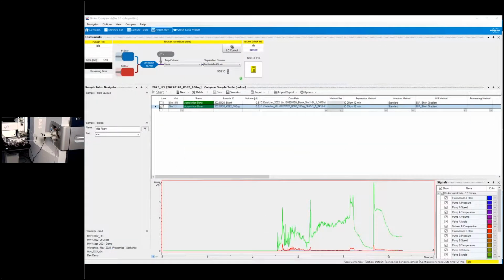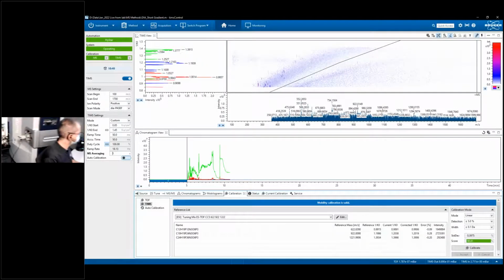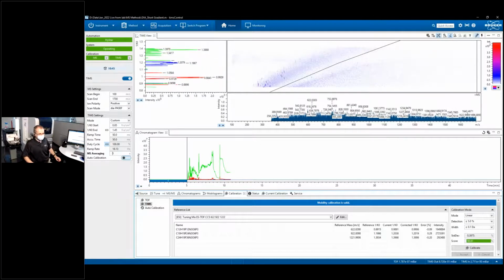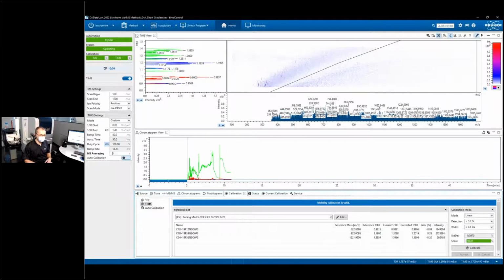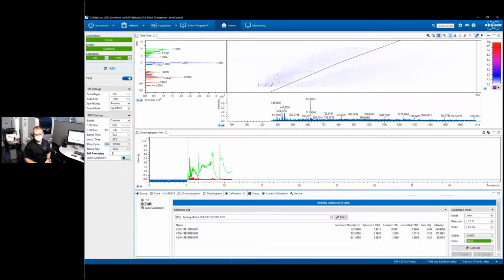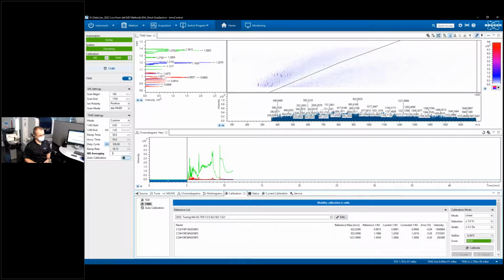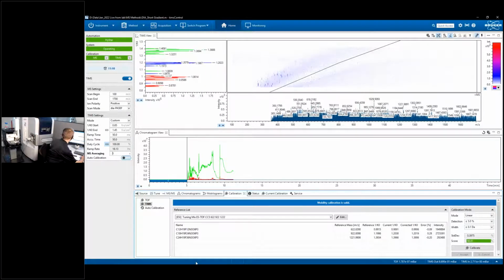There's actually a bunch of questions in, and I think we can try and get a couple of easy ones out of the way. There was a question of robustness, and about what routine maintenance might be required. So maybe you could speak to that a little on the instrument. It's good that you've got the instrument control. There was also a request, somebody texted me, saying it would be great to see the data actually being acquired. So I don't know if you want to inject another sample, and then we can see some peptides coming off the column before the end of the discussion.